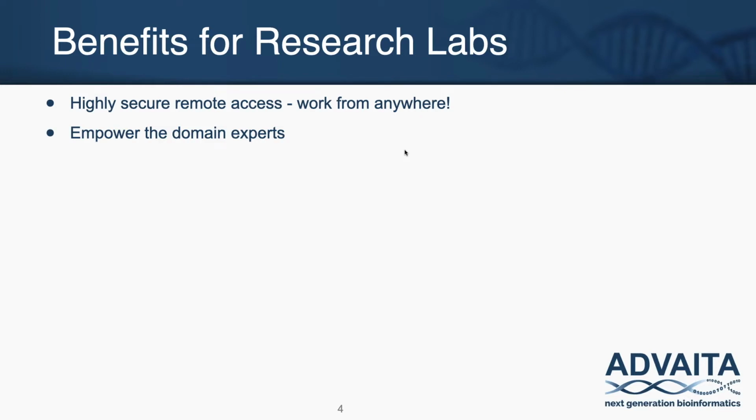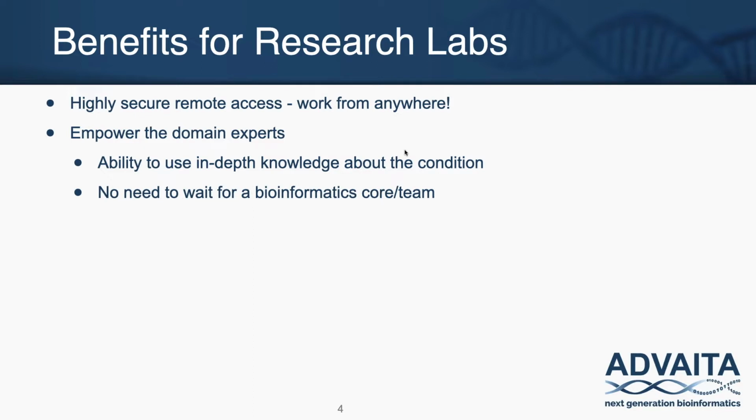This is really focused on empowering the domain experts to be the ones to make extraordinary discoveries, because you'll be able to use your in-depth knowledge about the condition to guide your interpretation. You will not have to wait for a bioinformatics team.